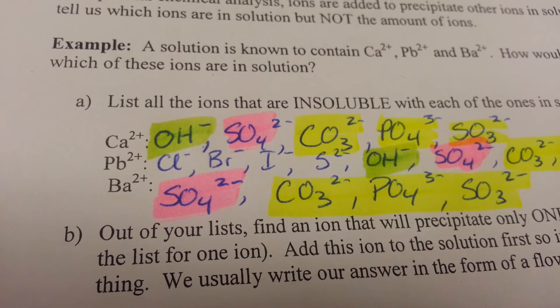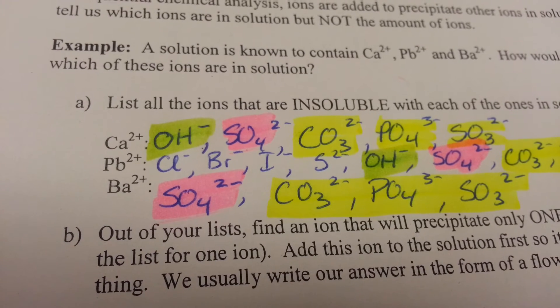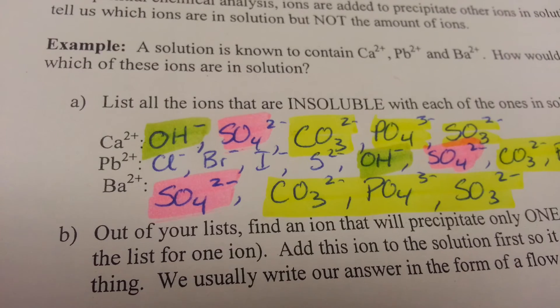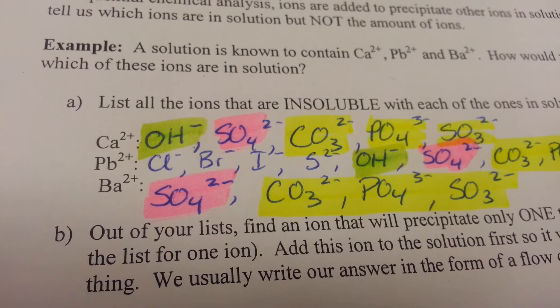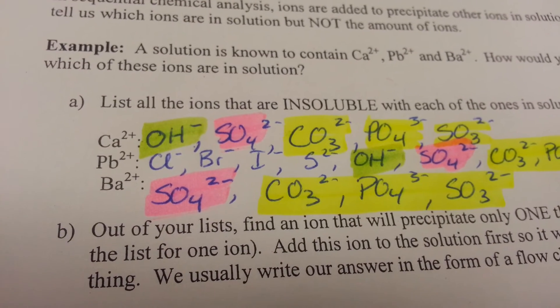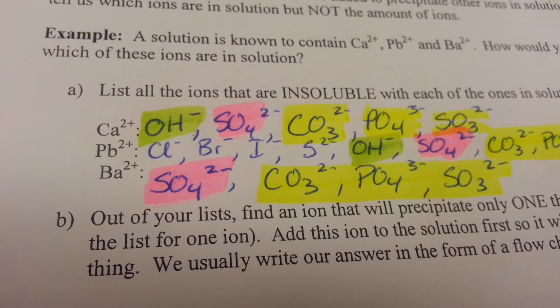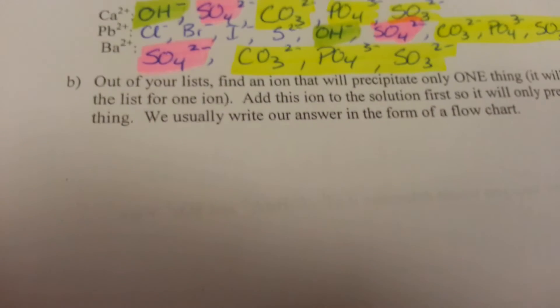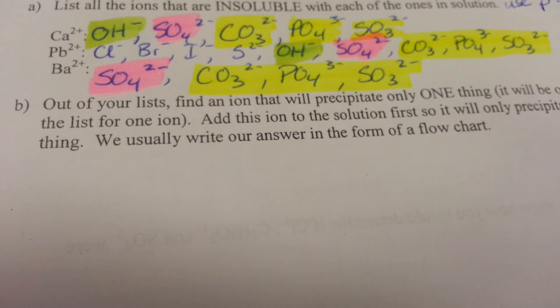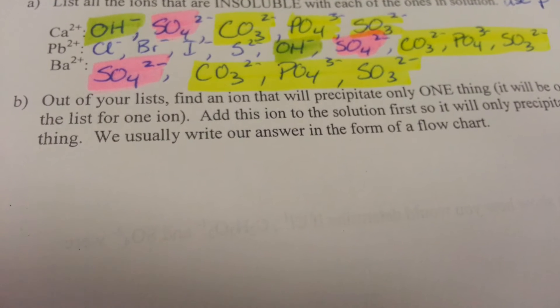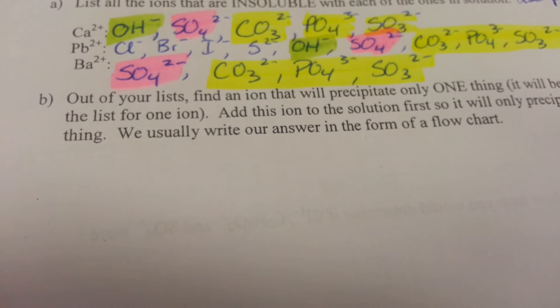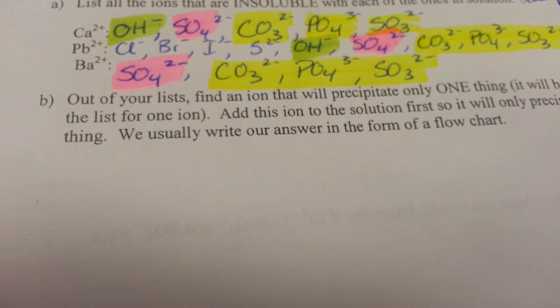We're going to identify whether or not lead is going to be present in a solution. We're going to try to identify this first because it has characteristics where it will create precipitate with chlorine, bromine, iodide, or sulfide. So starting our flow chart, we're going to try to utilize one of those four ions that will create a precipitate with lead. I will try to use safe substances and substances that typically are going to be common.